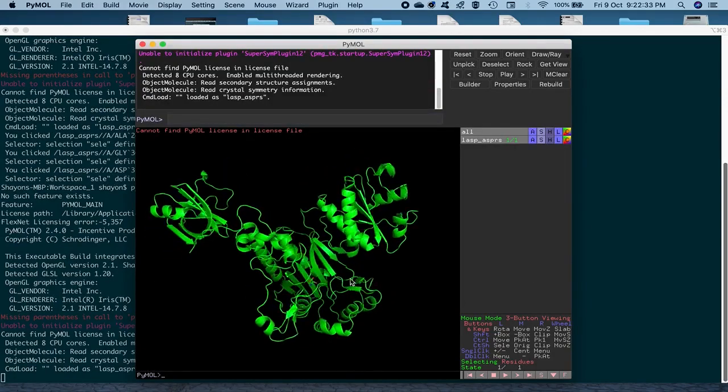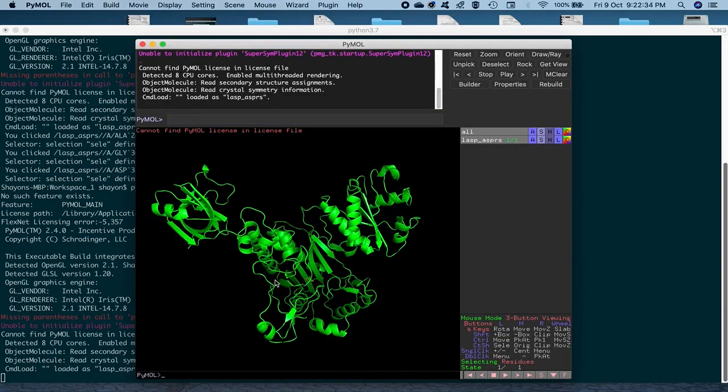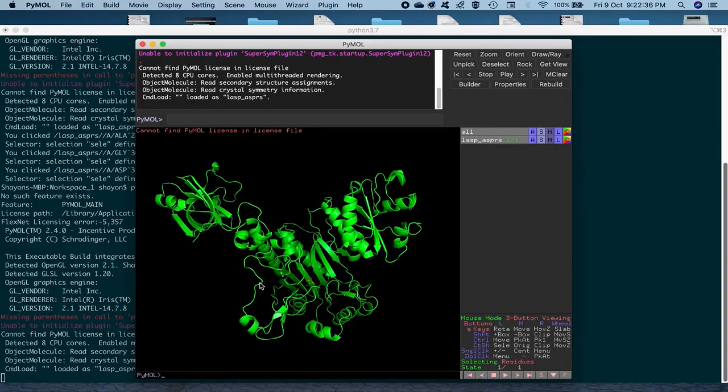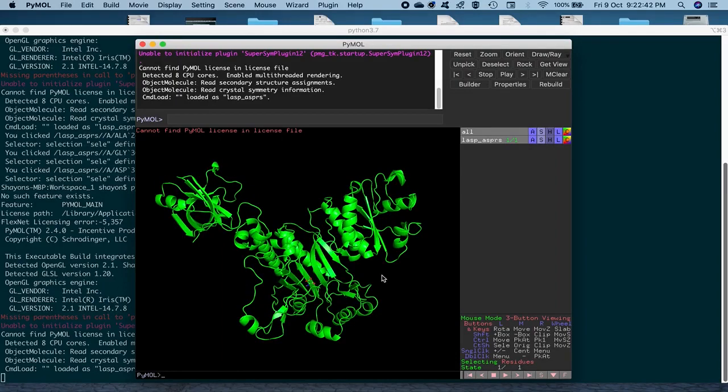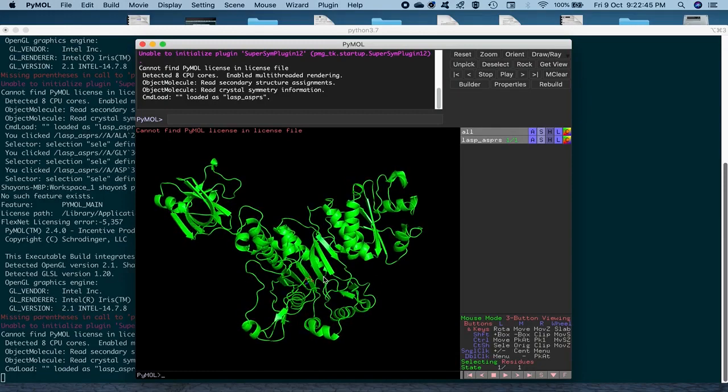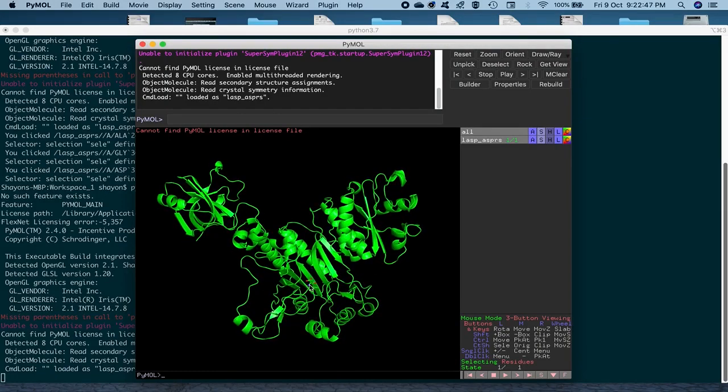So we open the structure and as you can see, it's loaded already in the new cartoon or the ribbon representation with the ligand that's named AMO out here, but it's actually L-asp being represented as licorice. So that's great.